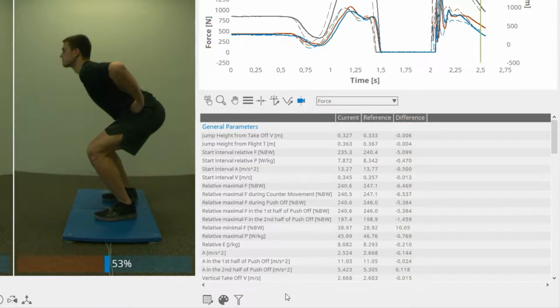The results from the table can be exported by clicking on the Export Table button. Coloring options allow you to highlight the cells or an entire repetition in the table depending on the parameters you select. Two options for highlighting the parameters are available and can be used separately or both at the same time.